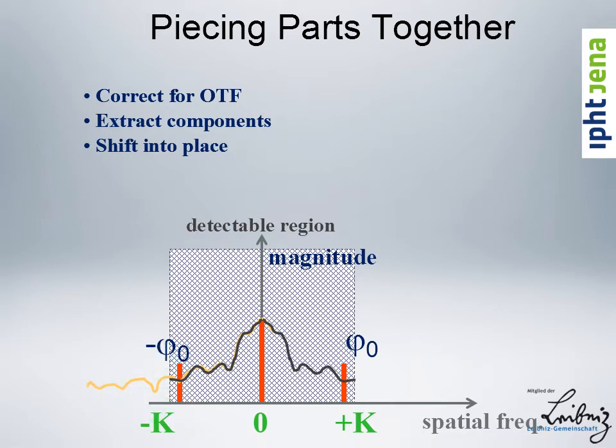So that's why it circumvents Abbe's frequency range here. The same you do with the negative component. You shift it by plus k such that its zero frequency overlaps, and then you join all three components.